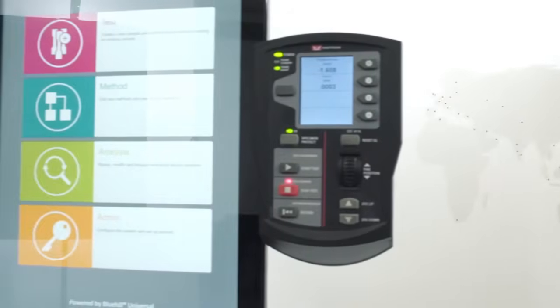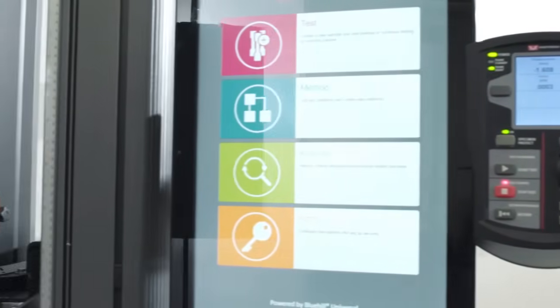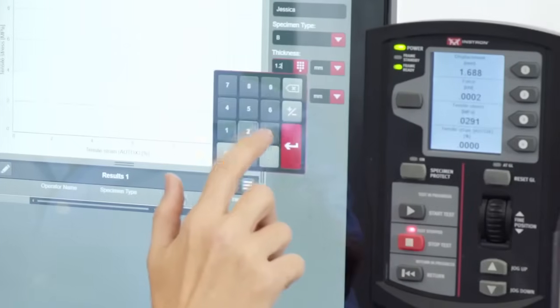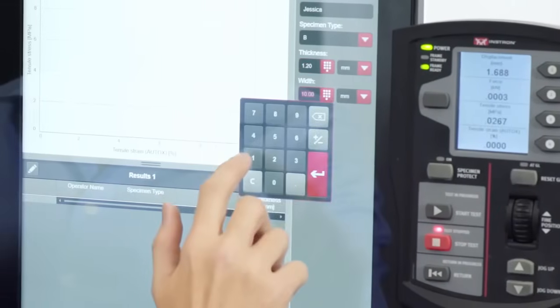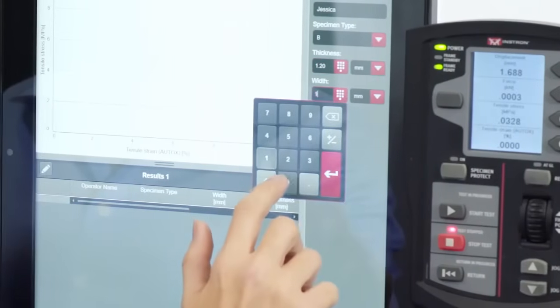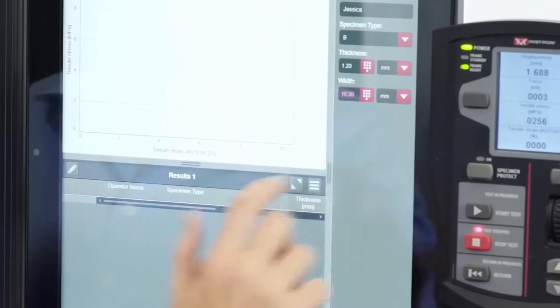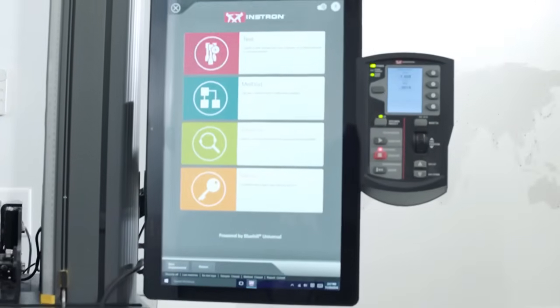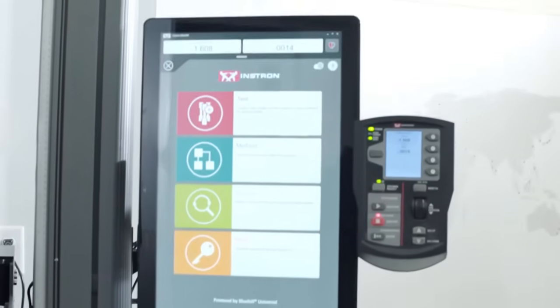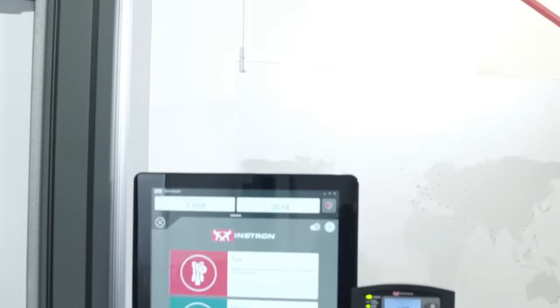Bluehill Universal, displayed on a side-mounted, large-format monitor, offers more than just a simple software interface for your mechanical testing needs. Its adjustability and proximity to the test space provide an ergonomic, perfect-fit solution for any lab.